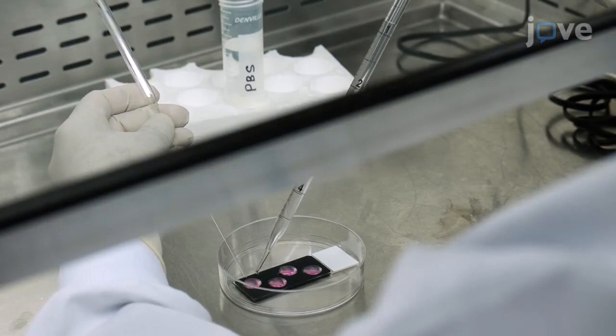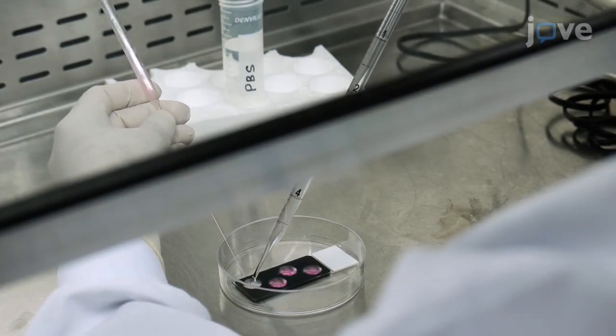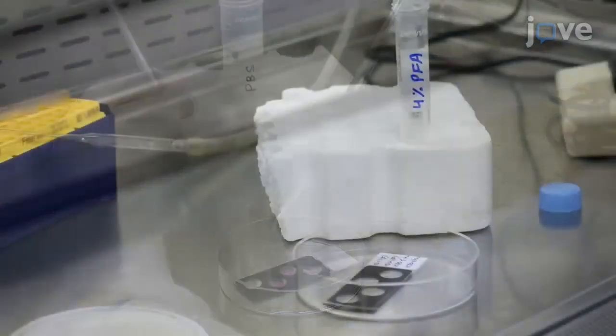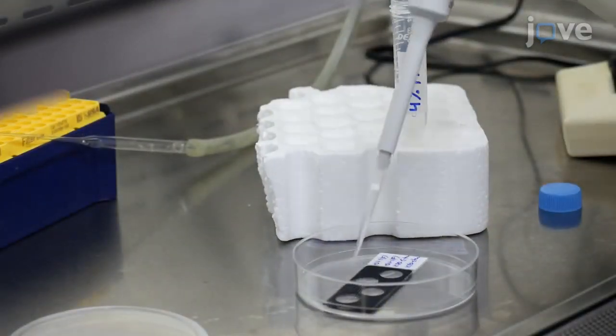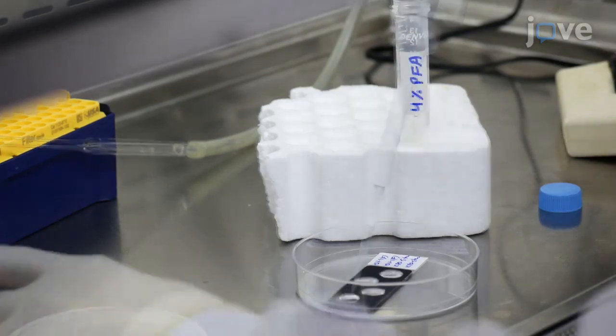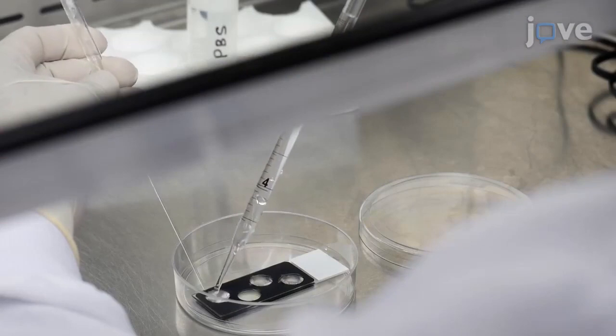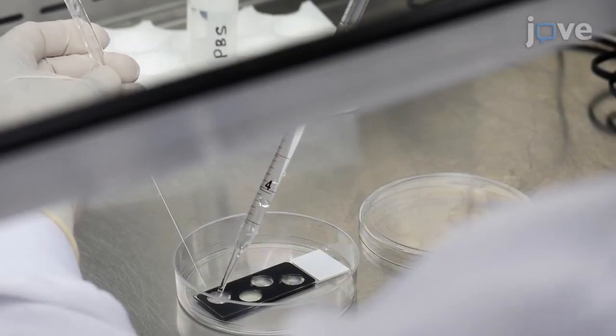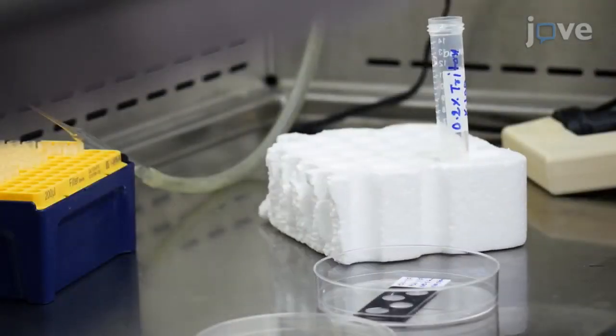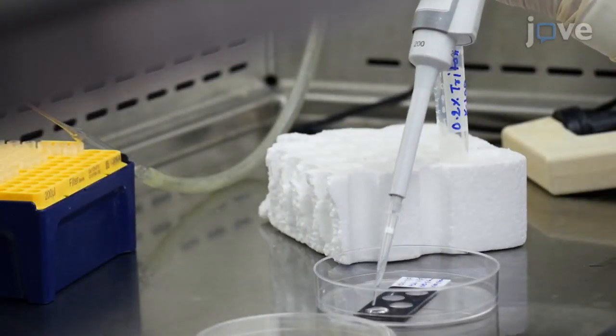For immunofluorescent staining of the virus-infected cells, quickly wash the cells 3 times with PBS, followed by an 8 to 10 minute incubation in 200 microliters of 4% paraformaldehyde in PBS per well. At the end of the fixation, wash the cells 3 times with 200 microliters of PBS per wash, and permeabilize the cells with 100 microliters of 0.2% non-ionic surfactant per well for 5 to 10 minutes.